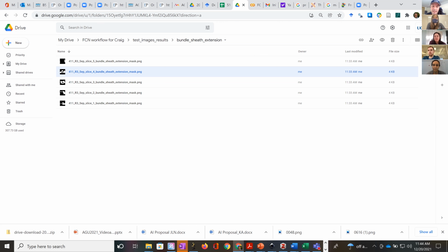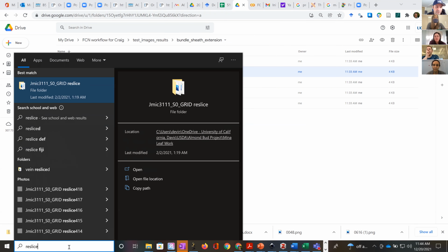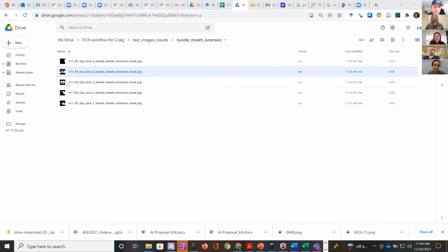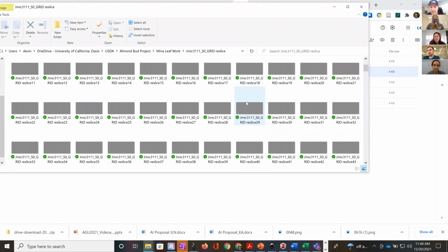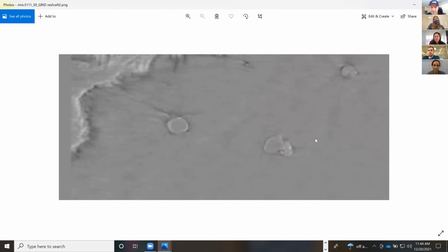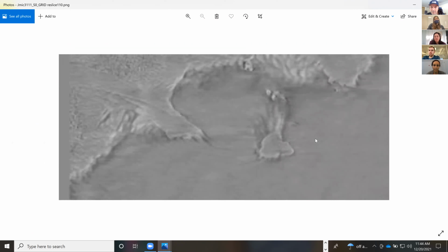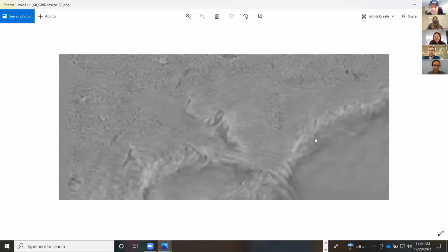Let me see if I can find, yeah. So here's a resliced stack. See what we can see. Sorry, my computer's not all that happy with me right now.